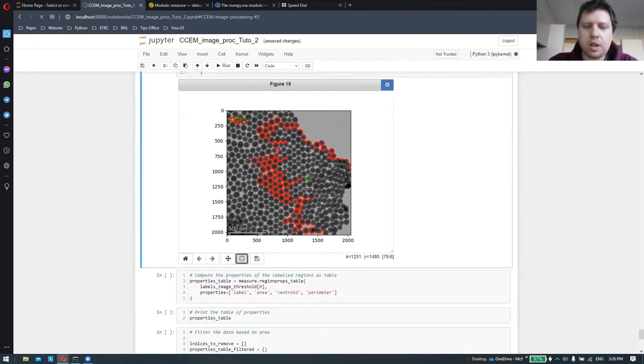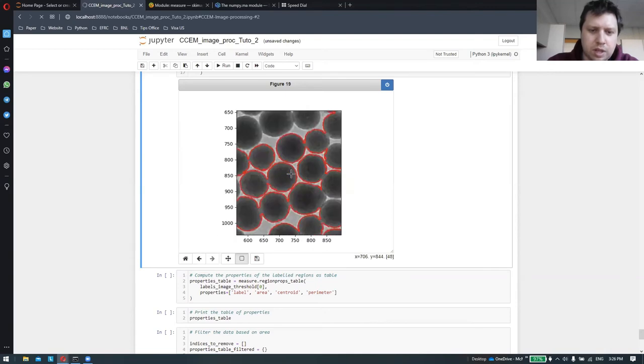As we discussed before, during the thresholding process, some of the elements couldn't be separated because they are touching each other. Either a different thresholding level would have been chosen to separate them, or you have to accept that. Plus, the area where you have this overlap, this big area, is identified as a single area. We can even go here. You can see the contour is following even in the areas where they are joined. So we have this type of surface that is a bit weird, but that is what has been identified.